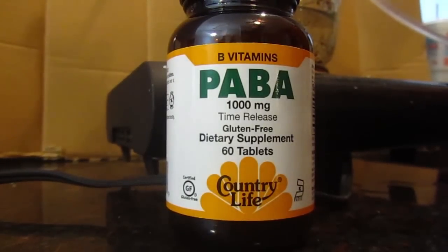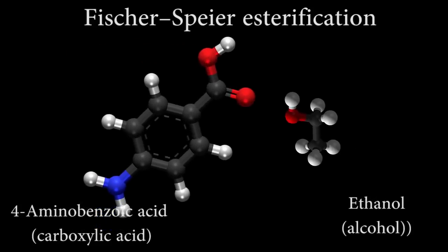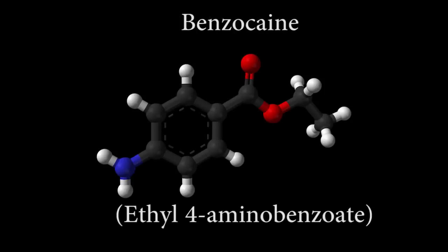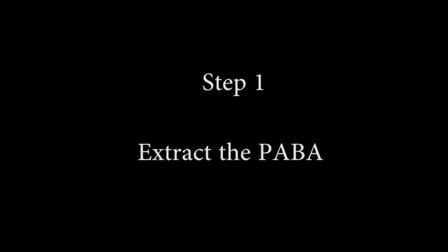And we're starting with PABA, para-aminobenzoic acid. It's a health food supplement or something, anyway. We're doing a Fischer esterification, which is between an acid, carboxylic acid, and an alcohol, ethanol, kind of like my other isopropyl nitrite video, same thing, we're using a catalyst of sulfuric acid.